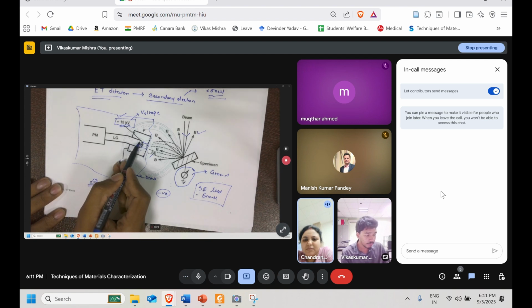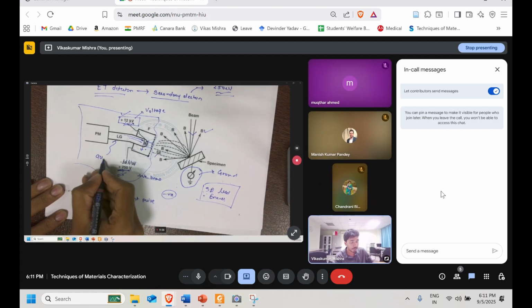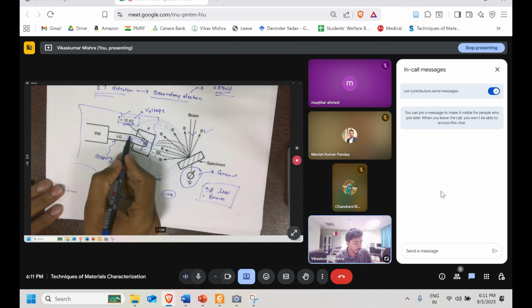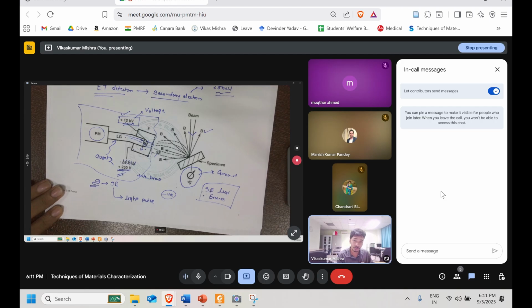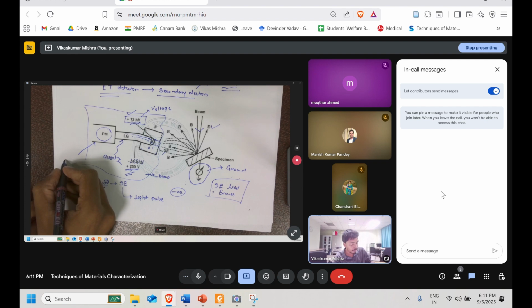Now this light, this energy which has been created, will be transmitted through this, which is made of a quartz tube. We know the phenomenon like fiber optics, how it happens. It's the same. It will transfer the light created by the phosphorescence over to the photomultiplier. Now what this photomultiplier will do is convert that light signal, the optic pulse, again to an electric pulse.